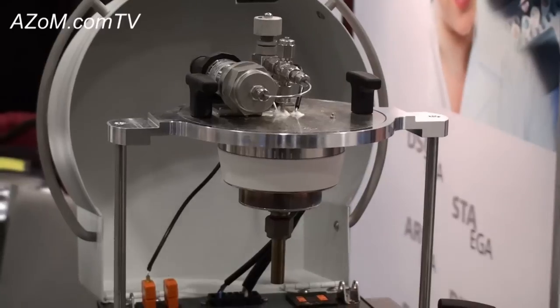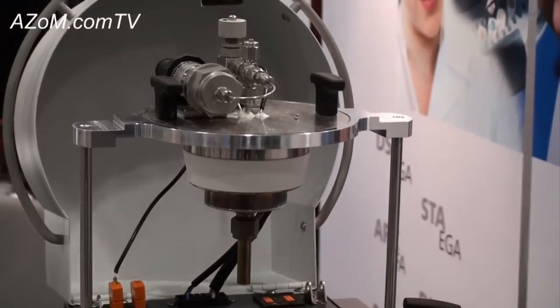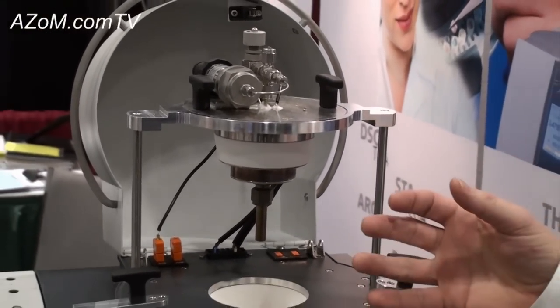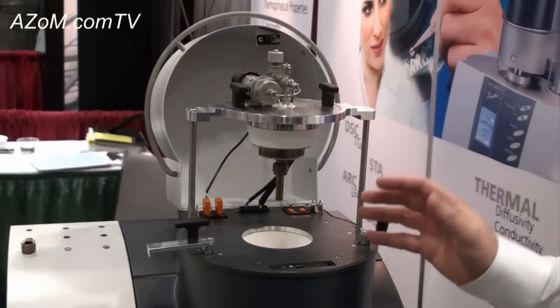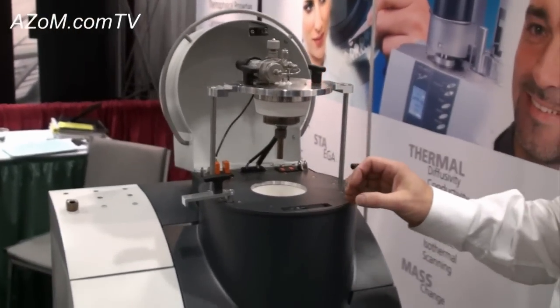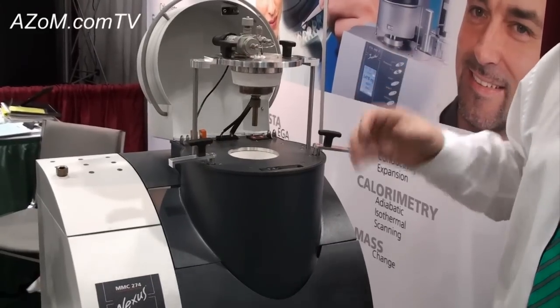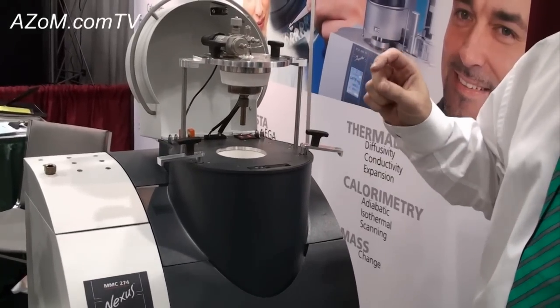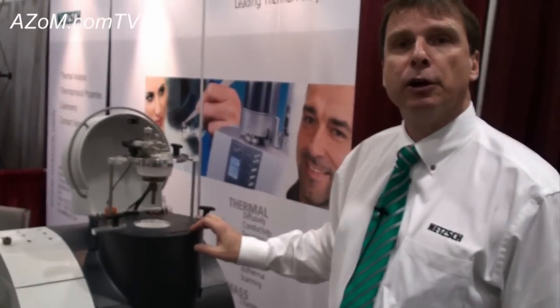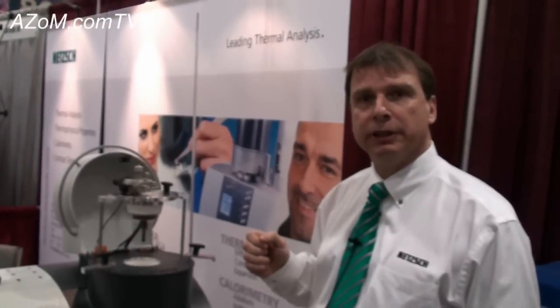This unit here acts like a DSC and has an external heater, so we can apply a heating ramp and measure the temperature change in the sample. It gives us DSC-like information but with the unique ability to measure large samples — in a DSC you're limited to about 100 microliters, whereas here we can do up to a milliliter or two. Another advantage is that we can also measure pressure as the sample builds up, which is something you cannot do in a normal DSC.